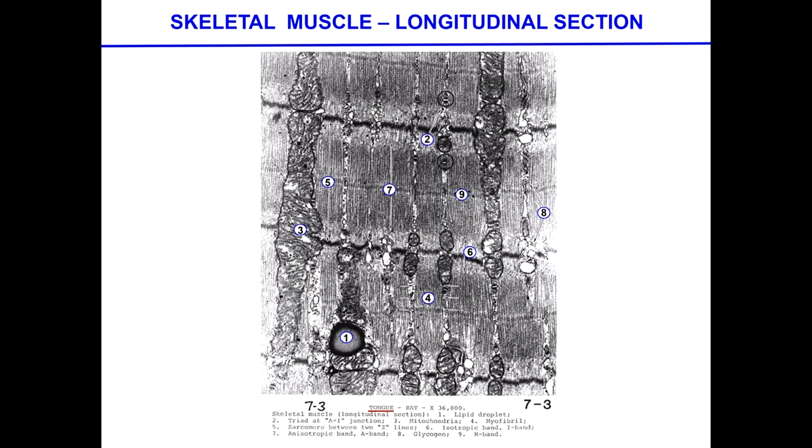In case you still haven't seen everything about it, you have now to see the same structure in different locations. These are a bunch of mitochondria in there, and everything is about the same. In this case, number 8 is located in this area, which is where, as I said, glycogen accumulates, in or in the proximity of the sarcoplasmic reticulum. Everything else has to do with the structures that we have already been relating to. And just in case you were wondering, there is a triad right there.